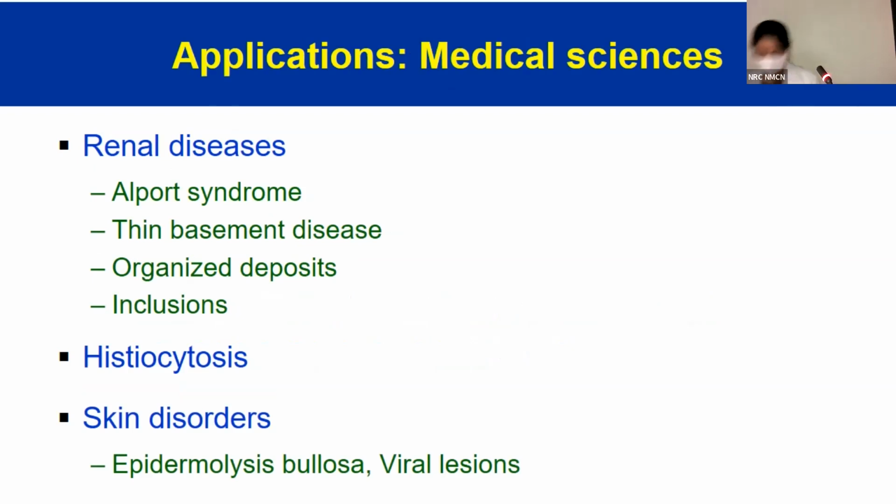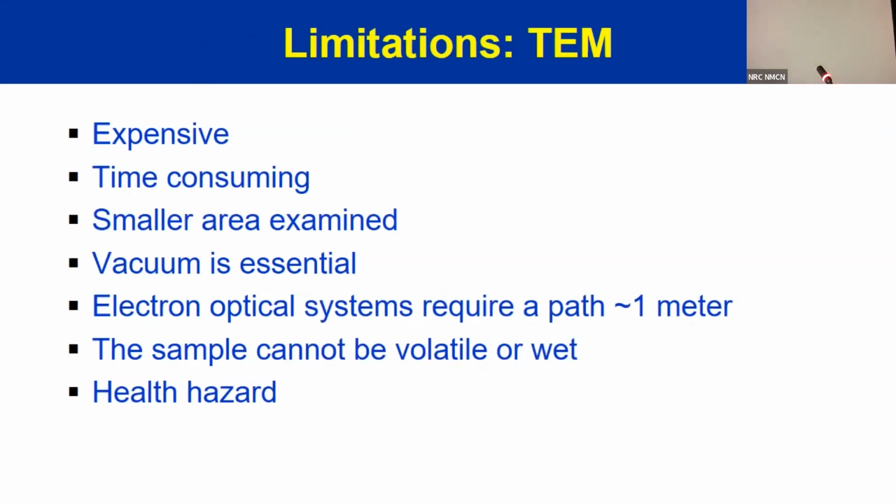What are the applications that you will tell? I think everybody can tell. What do you think? Why do you need it in nephrology? That is one science where we are using the maximum amount of electron microscopy, nephrology. That is why I'm asking. So what do you use it for?